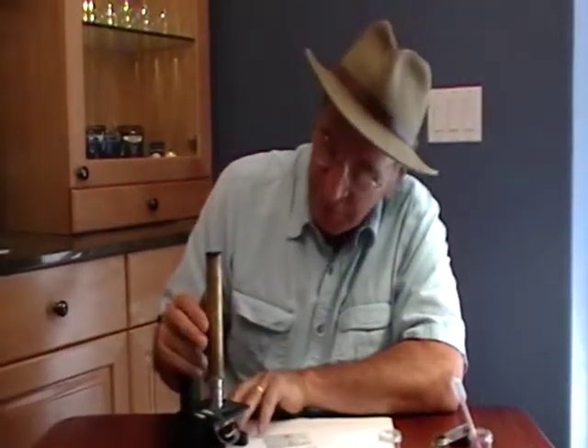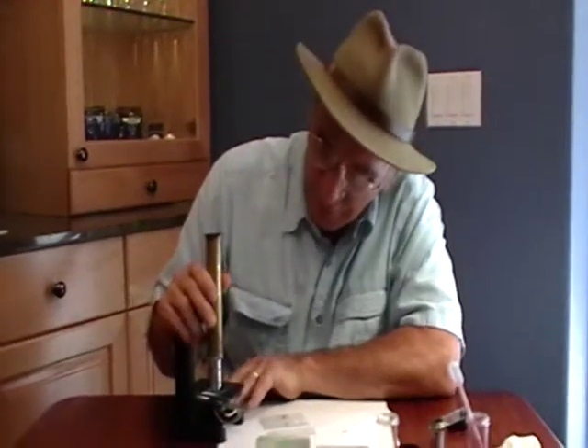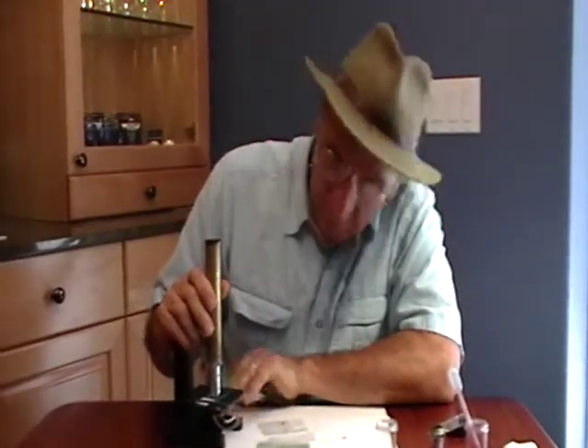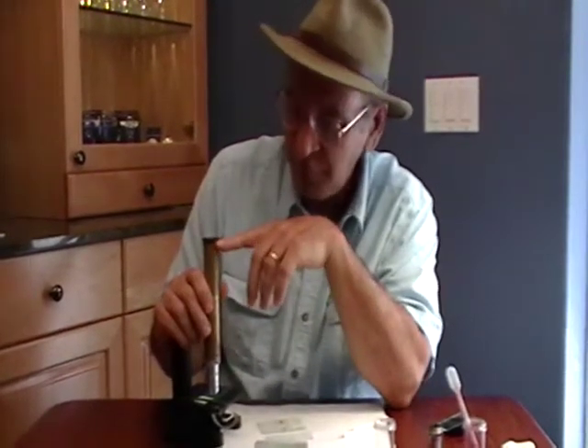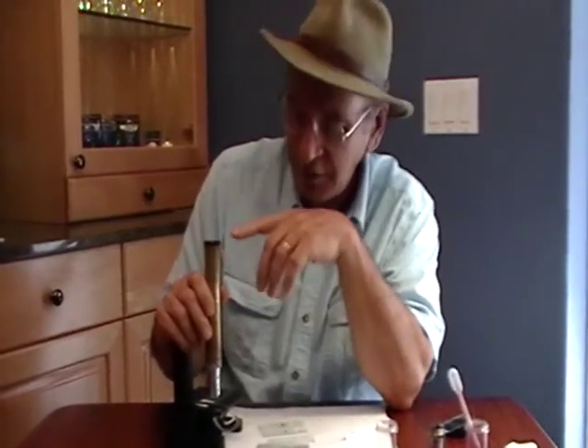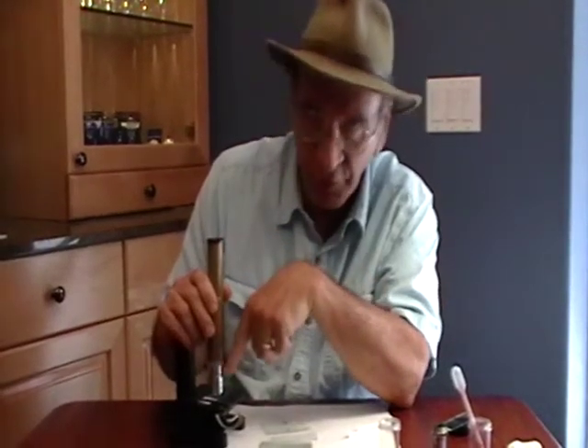Hi, I'm Dennis Brock. This is my Magiscope and it has a 40x objective on it. Now with the 40x objective and the 5x eyepiece on top, the total magnification is 200x because you multiply the 5x eyepiece times the 40x objective.